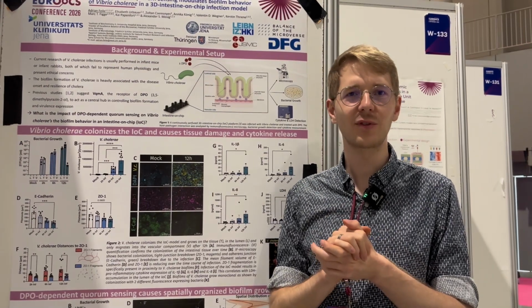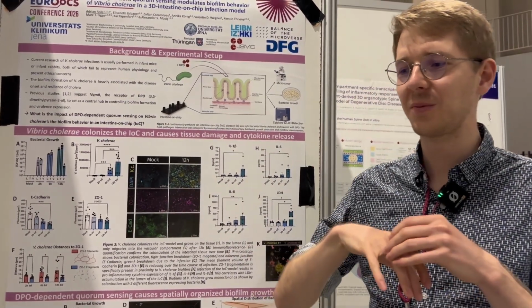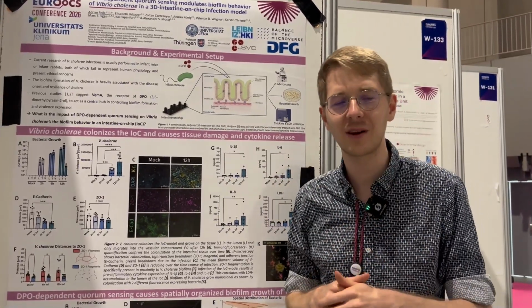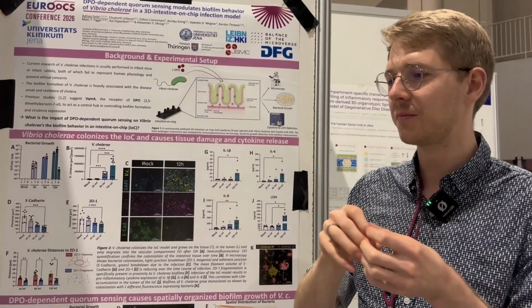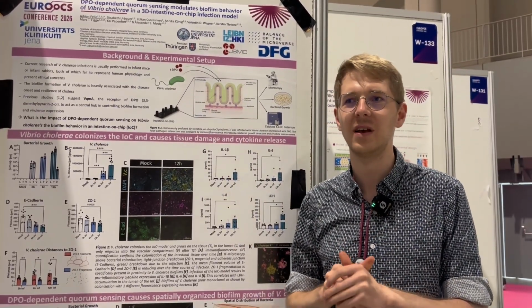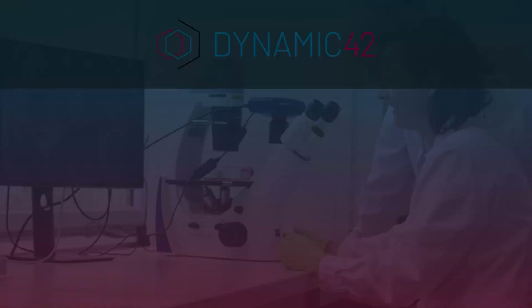Once you've established your model and it's running, you really have this capability of exploring a new biology where we have now shear stress going in, we have the replacement of molecules, we have gradients that are building up inside of the chip, and this is something that traditional cell cultures are just not able to recapitulate.